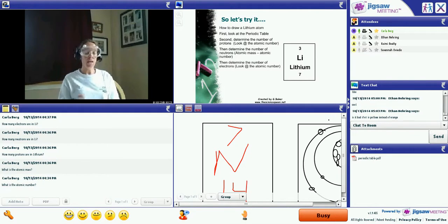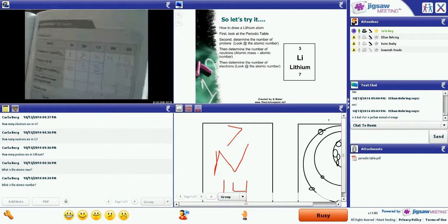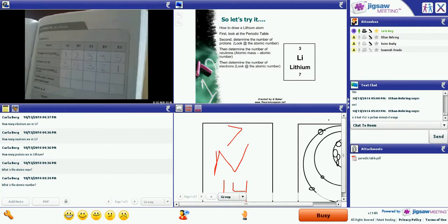Now we are going to do the drops of potassium iodide. In well A1 it was 5, B1 4, C1 it was 3, D1 it was 2, E1 it was 1. So your data table should look something similar to that.